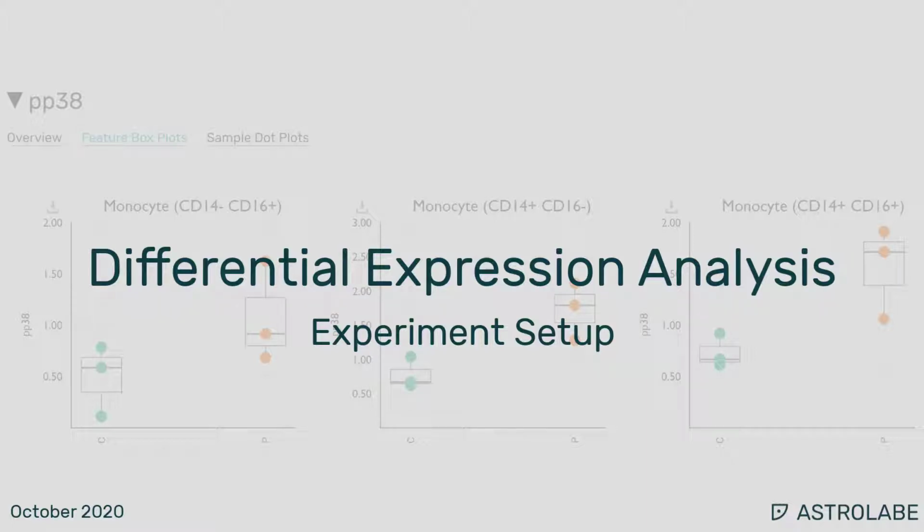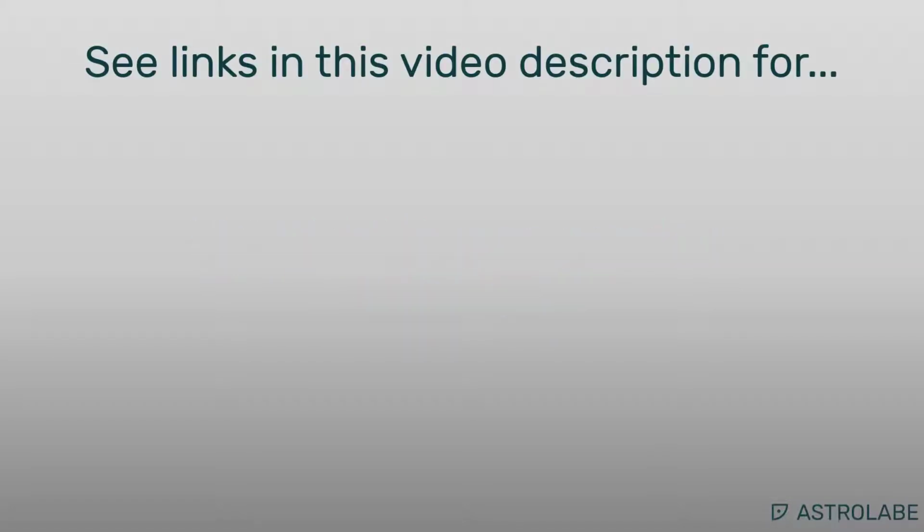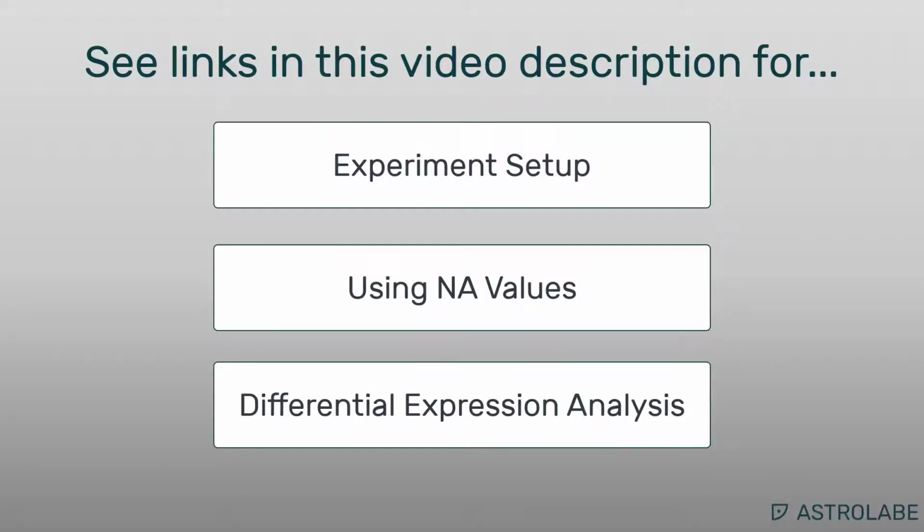In this video, I will discuss how to set up differential expression analysis for your experiment. This video will build on material presented in other tutorials. If you need a refresher, you can find links to tutorials about experiment setup, using NA values for conditional analysis, and differential expression analysis below.